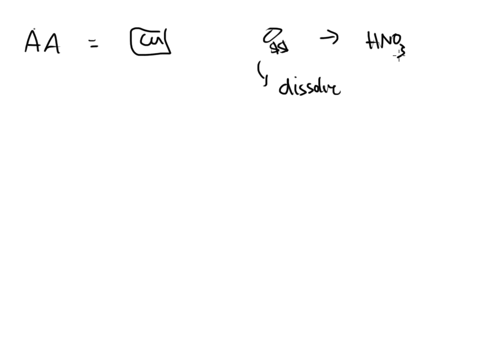Well, that's great, because HNO3 dissolved the copper. But the problem is that not only did copper get dissolved, but zinc was dissolved as well. And that's why we had to go through all of those steps with those reagents to make sure that zinc would not precipitate out. It was a way that we could separate the copper precipitate from the zinc. That's why we used all of those reagents.